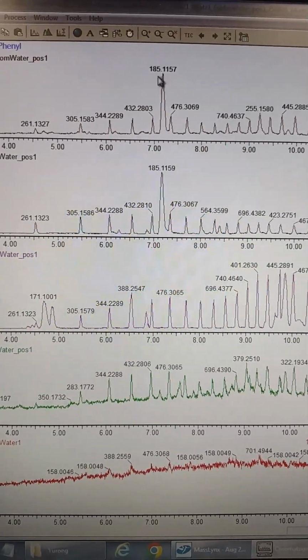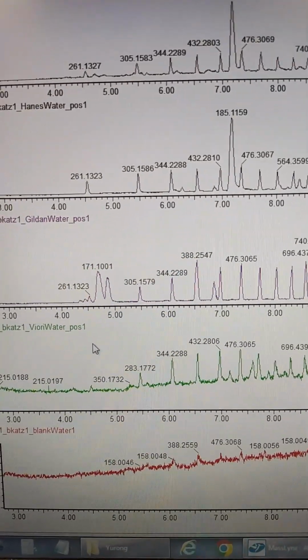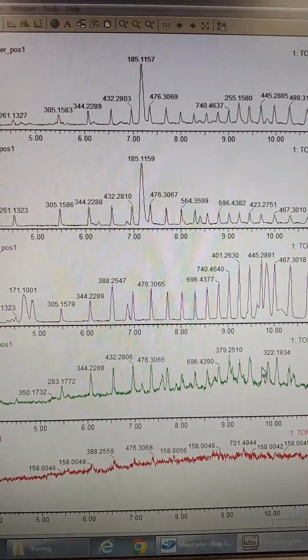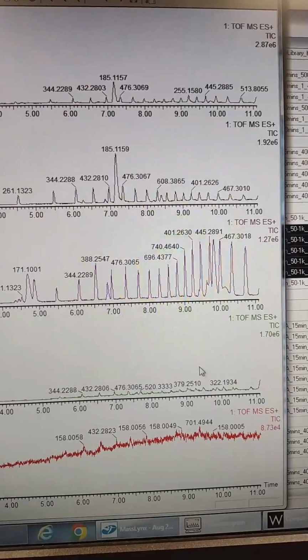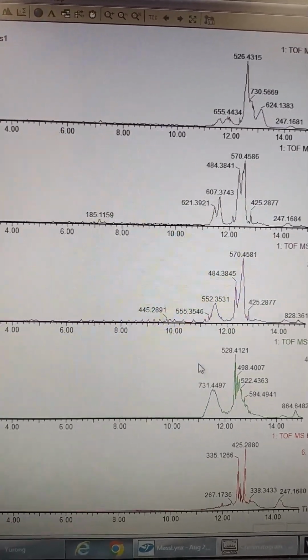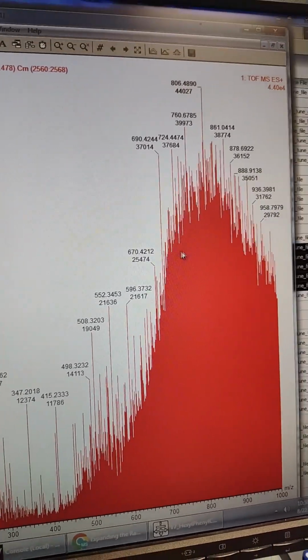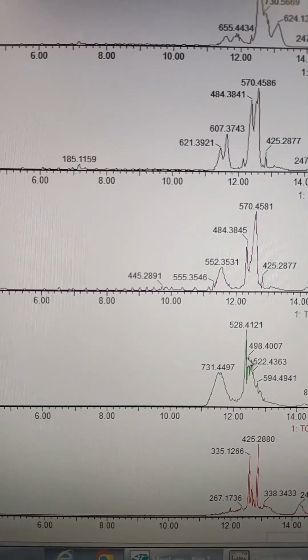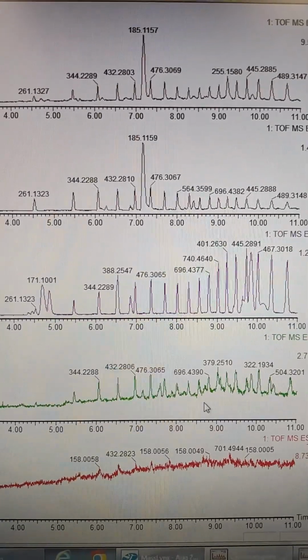And then you're seeing like these blobs that don't have that repetitive pattern. At 185, that's like an actual molecule. 171, that's an actual molecule. So even with actual molecules, the Viori is actually much cleaner than the others. So except for the blob at the end, we look at this blob at the end, and it is an odd looking blob. I don't know what it is, but it's in there. But other than that blob, the Viori shirt's quite clean in the polar region, and that's kind of what we were seeing from the extract anyways.